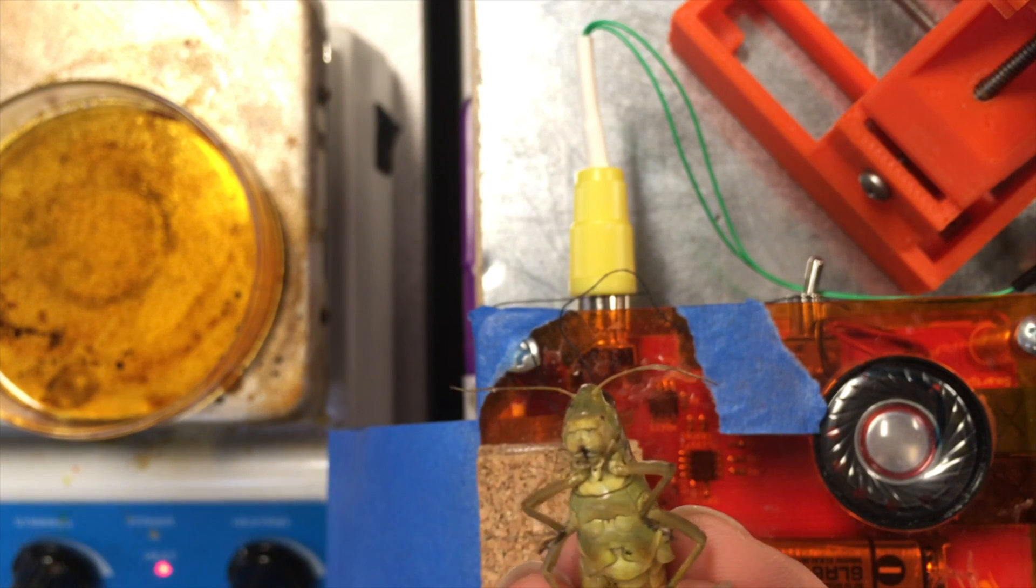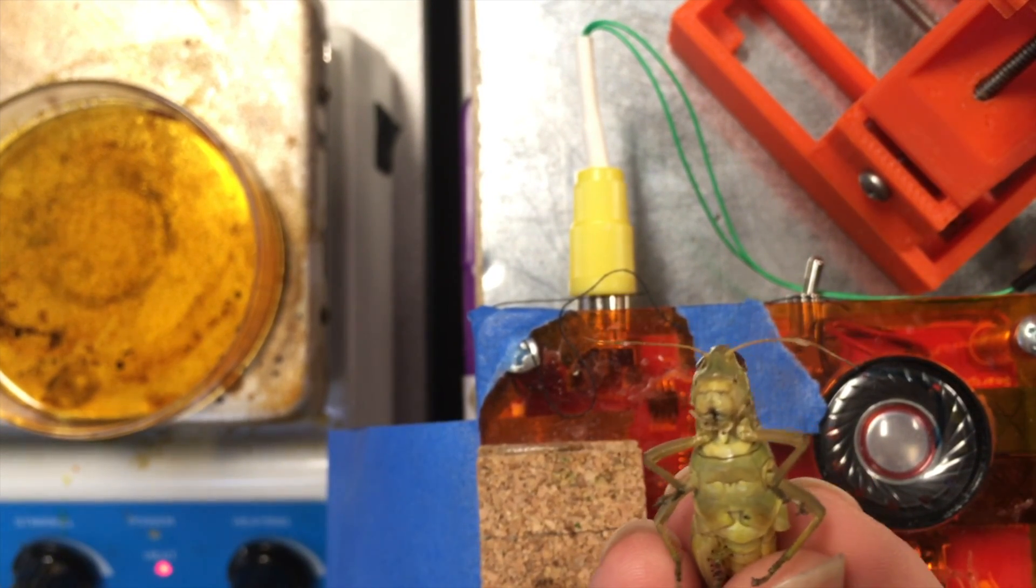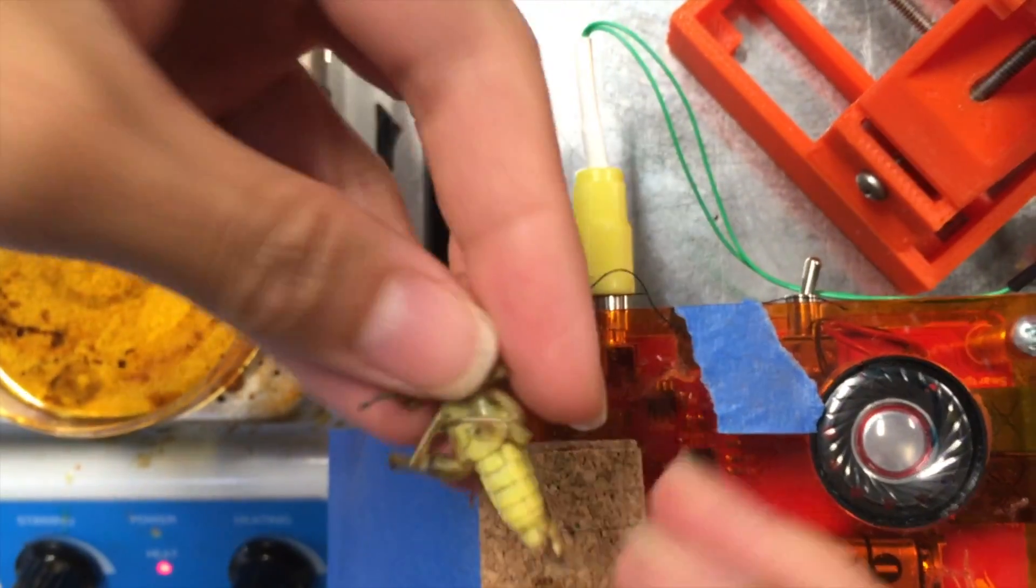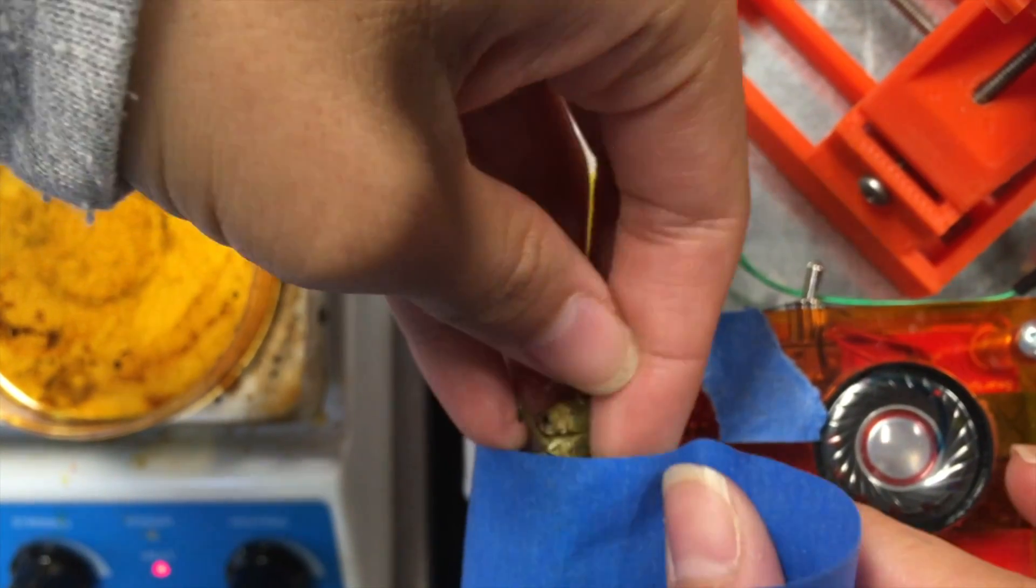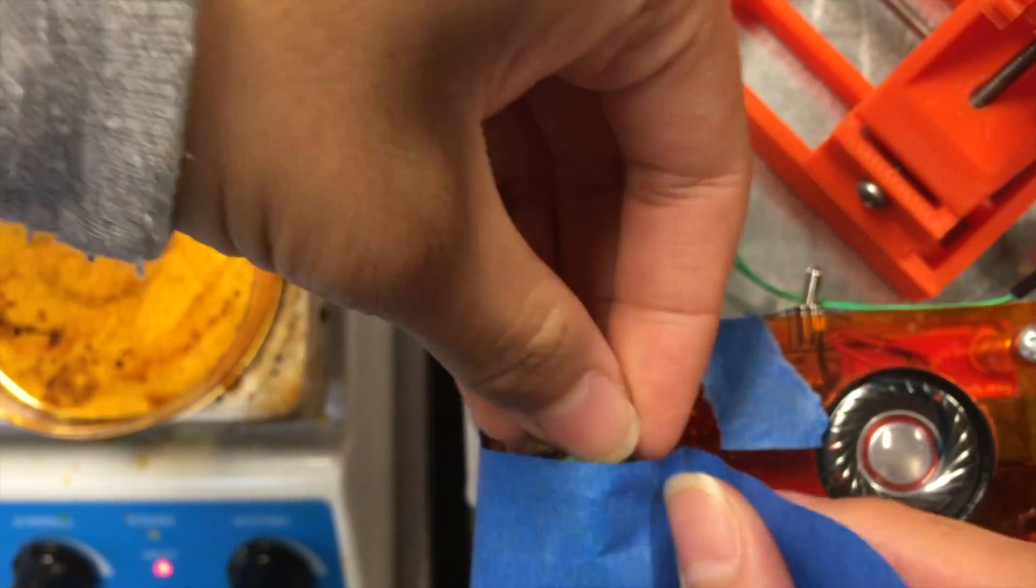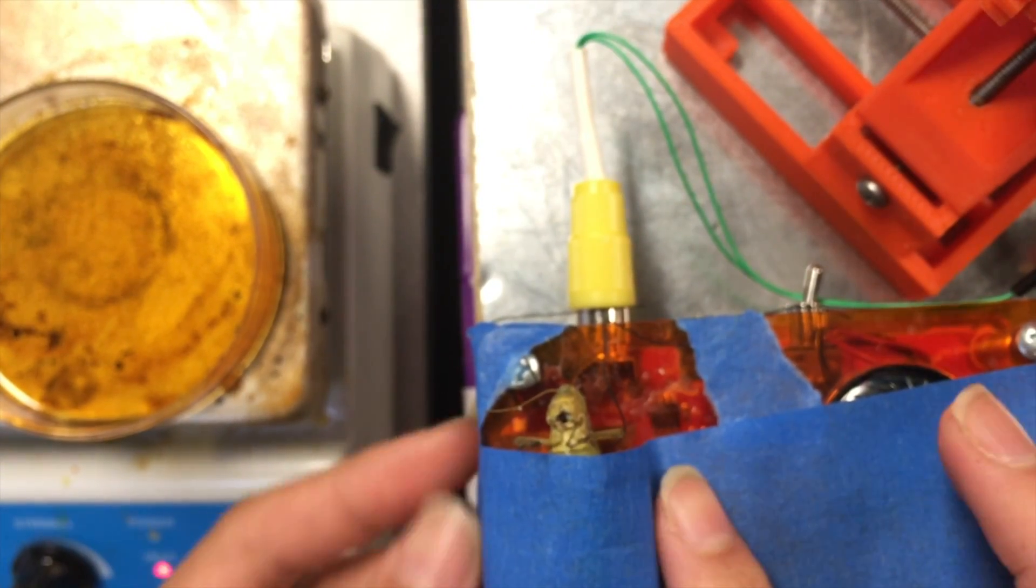Here I have a grasshopper caught here in Ann Arbor. It's anesthetized in the fridge for 15 minutes. So now we're going to tape it down on the corkboard piece on the spiker box, exposing the head and a little bit of the thorax where we will be placing the electrodes.